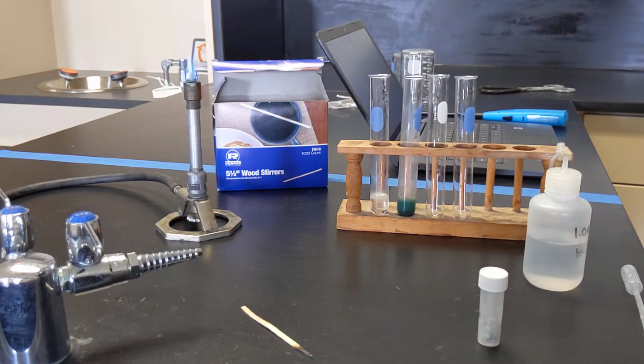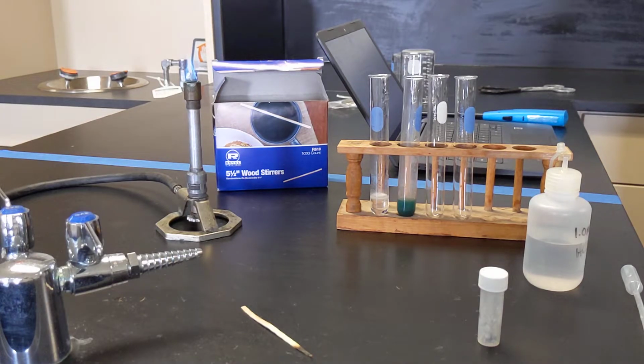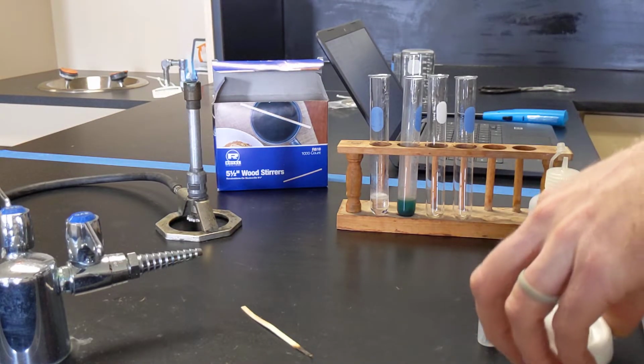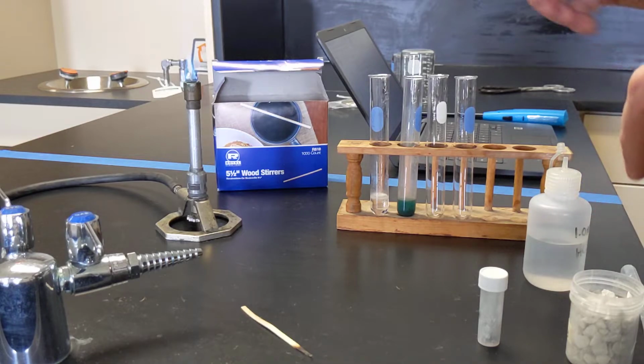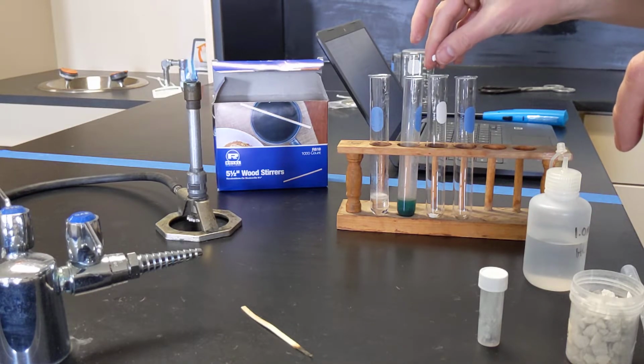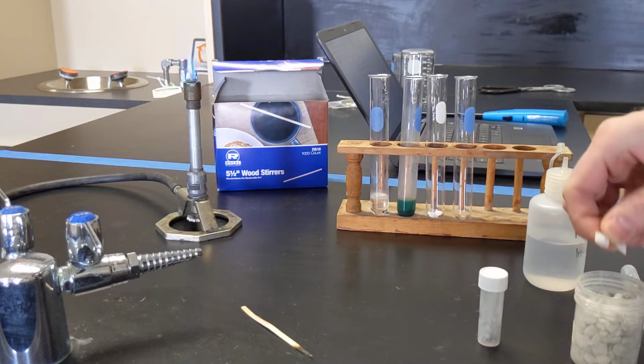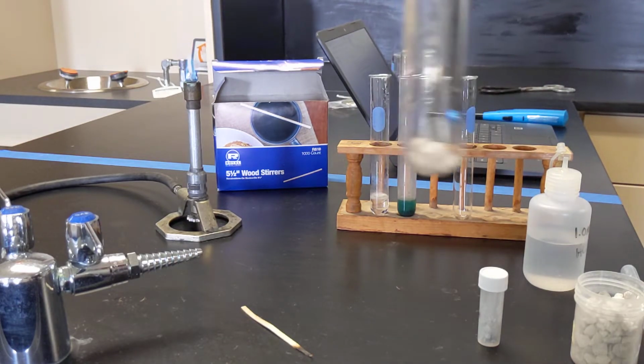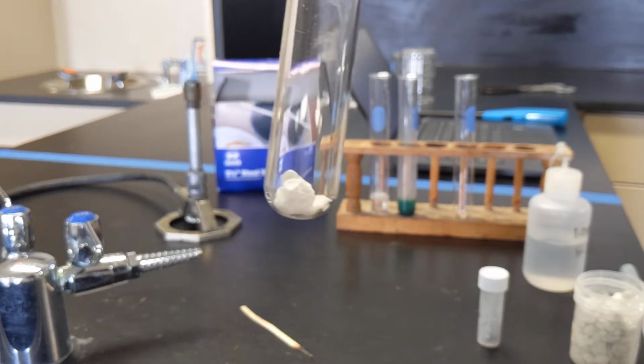Okay, reaction number 4 is the reaction between calcium carbonate and hydrochloric acid. Calcium carbonate is better known as a few other things, some of which are chalk or coral, or in this case I have marble chips. But they're all made out of basically the same thing, calcium carbonate.